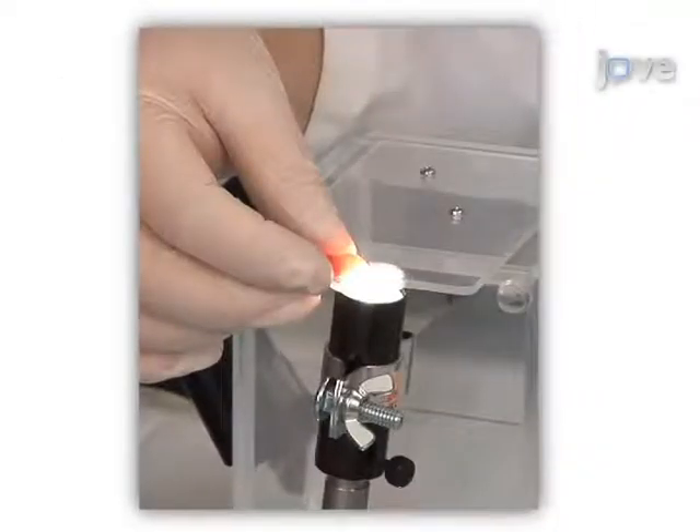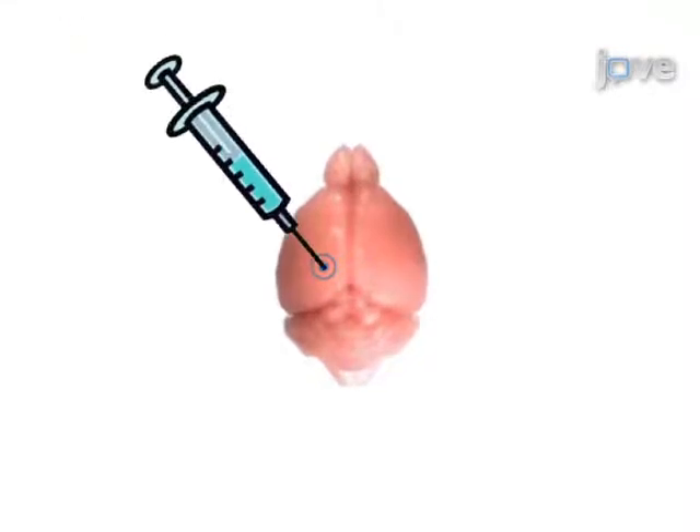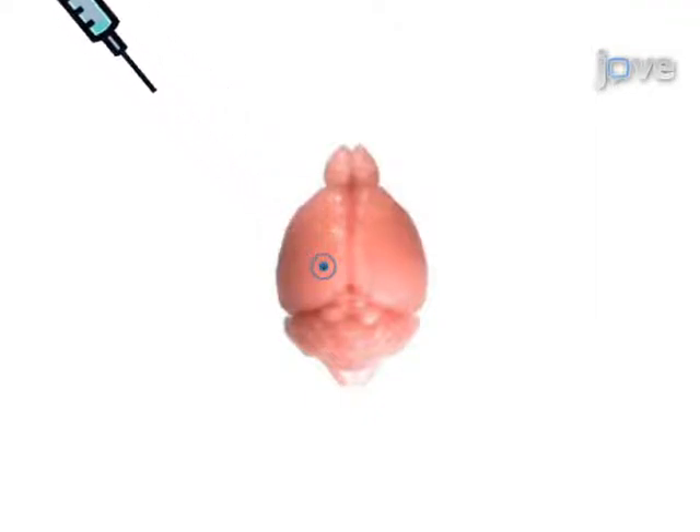For intracerebroventricular injection, the anesthetized mouse is first placed on top of a fiber optic light source to illuminate the sagittal and transverse sinuses. The inoculum is then carefully injected at a point lateral to the sagittal suture and rostral to the coronary suture. If performed correctly, the inoculum will be distributed first in the injected ventricle and will eventually reach the other ventricle.